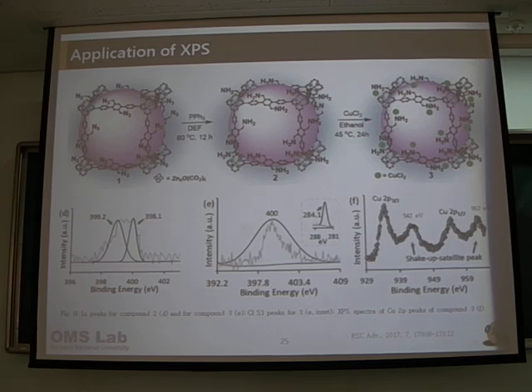So I'm just asking, okay, I understand that after coordination, the overall weight has been increased. Okay, then I understand. But what is that due to? That degradation is the amine degradation that you are looking at. You just said that this last peak is slightly increased. But is that the amine or the copper or what? That's what I'm asking. That degradation is due to what degradation? You understand my question? Yes, sir. Yes. You understand my question? Yeah. And answer it.